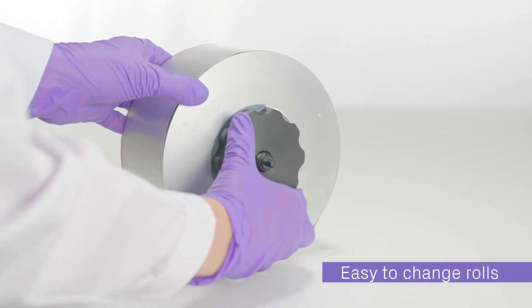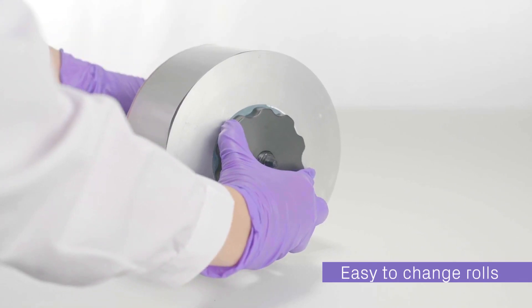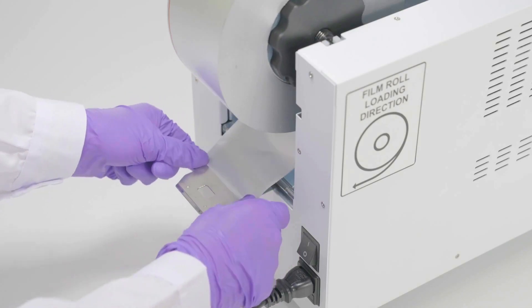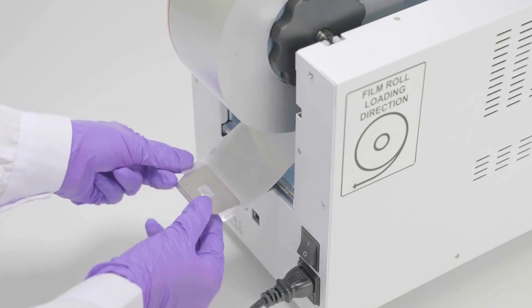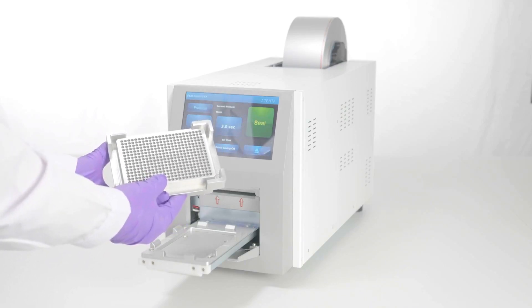Changing sealing rolls has never been easier. Our roll-loading mechanism is designed for quick and effortless replacement, minimizing downtime and maximizing productivity. Experience unparalleled efficiency with our rapid sealing cycle systems, significantly reducing the time spent on manual sealing processes.